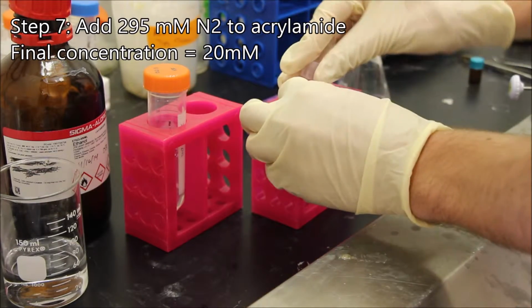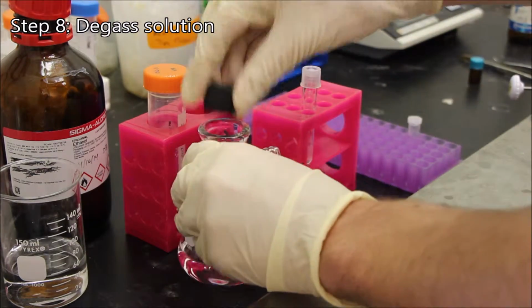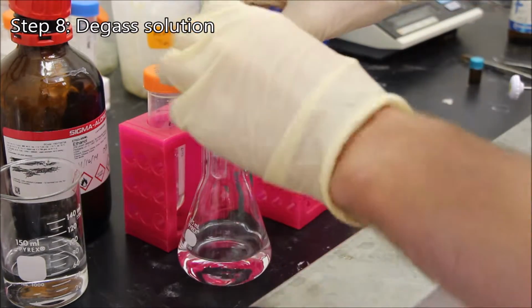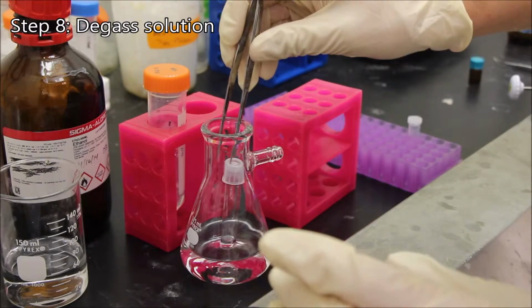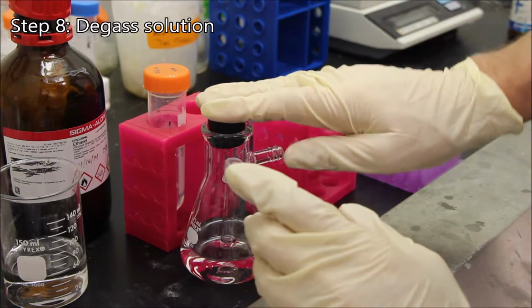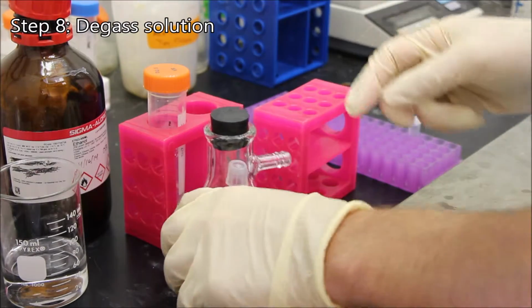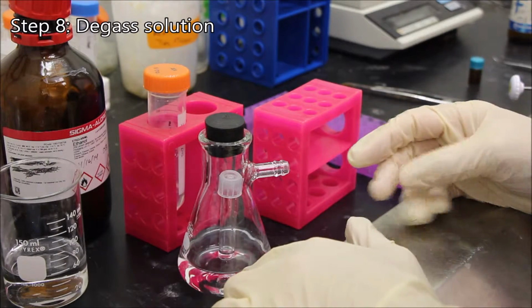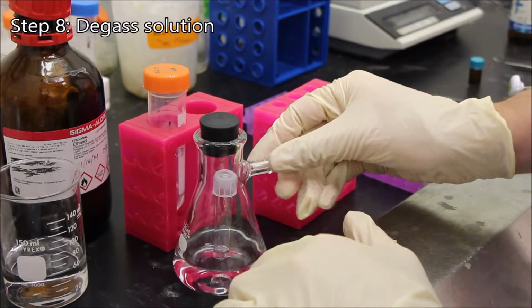So I put a cap on, and I have this sidearm flask with a little bit of water in the bottom. And what we need to do is for 15 minutes degas this solution to prevent any oxygen in the solution from inhibiting the polymerization reaction. So I've put this on there. I'm going to put this in the sonicator water bath and set it on degas for 15 minutes, and the whole time there'll be a vacuum applied to this sidearm.